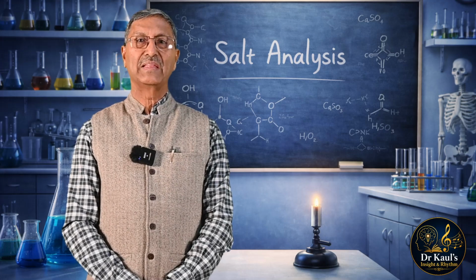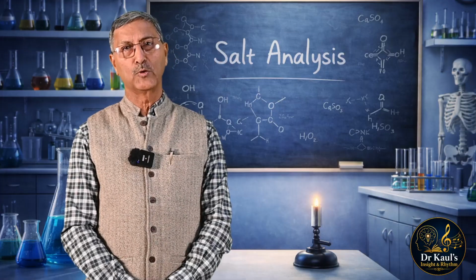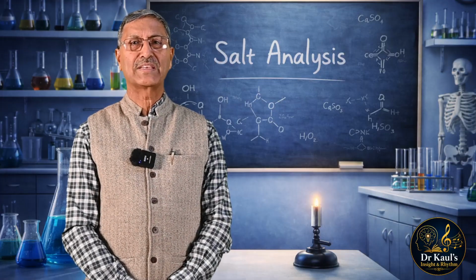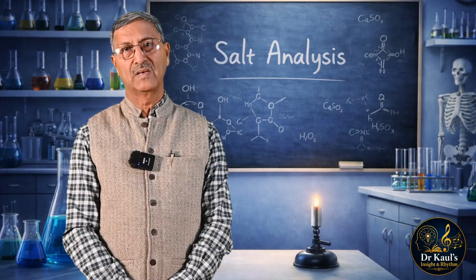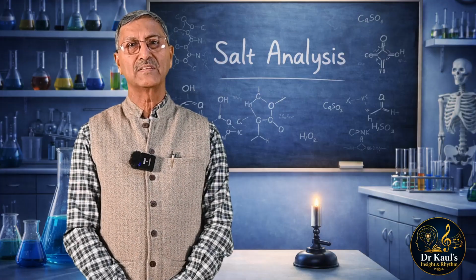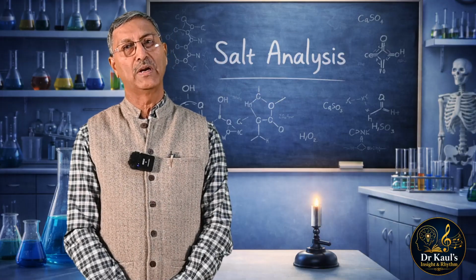Dear viewers, in the previous lecture on the discussion on sulfate, phosphate and borate, we had taken up the sulfate radical only. In this lecture, I'll be taking up the chemistry of the confirmation of phosphate and borate radicals. I hope you will easily understand these radicals in the form of these two lectures, the chemistry behind the confirmation of sulfate, phosphate and borate radicals.